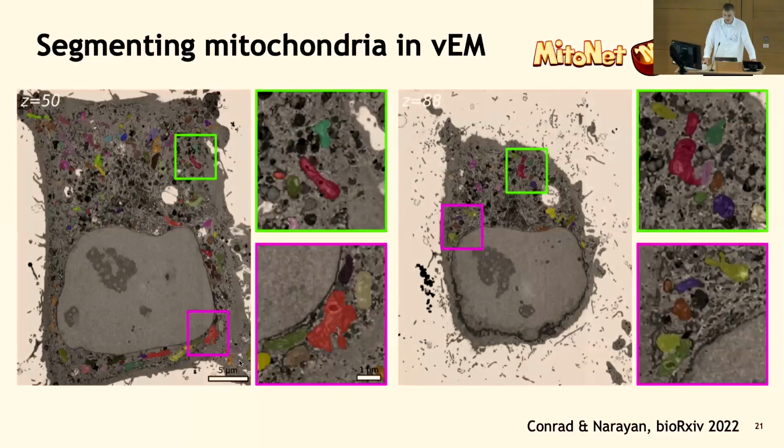And when applied to our data, the results are incredibly good, and it's able to provide out-of-the-box performance for the segmentation of mitochondria that is sufficient for many tasks and good for our use case.